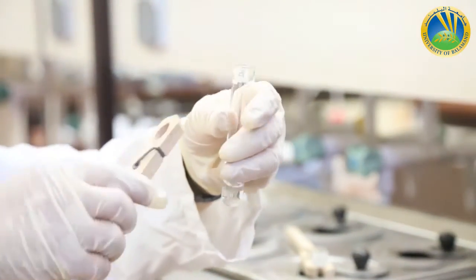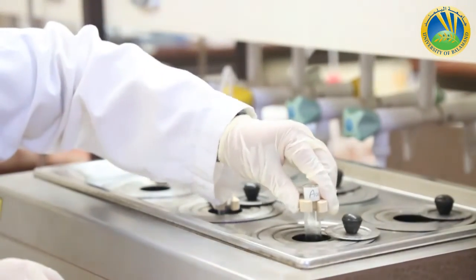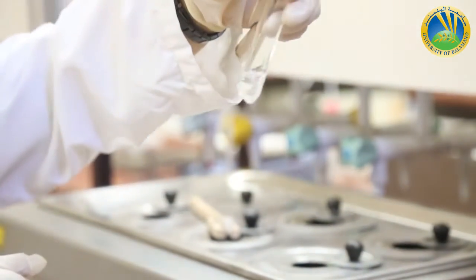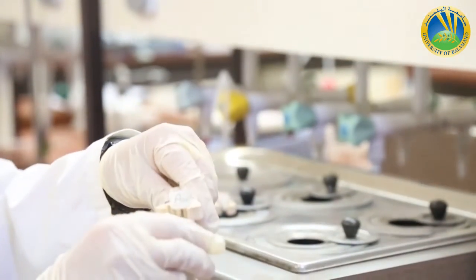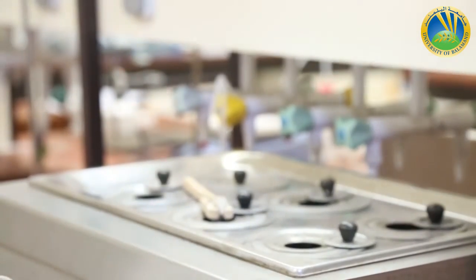So I will do the test at hot. Let me check the acetanilide at hot. It did not dissolve. So acetanilide is not soluble inside the petroleum ether at hot.